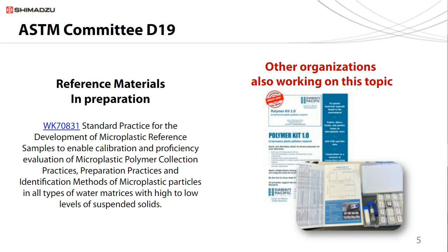We got one of these kits in our lab, and we are working on generating additional data from these samples. Also, I need to mention that Jennifer Lynch is associated with NIST. So this demonstrates that there are a lot of organizations that are interested in standardizing all the steps in the microplastics analysis.